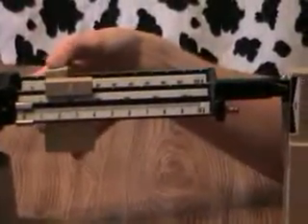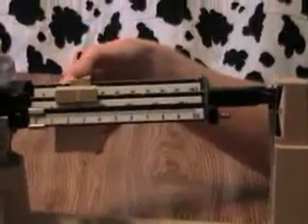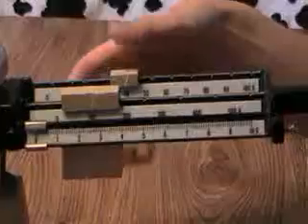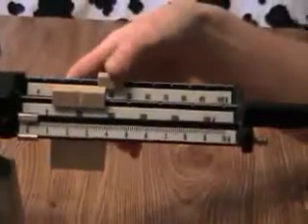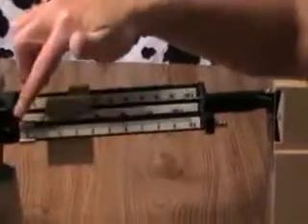I'm at twenty and it's too light. Thirty — too light. Fifty — too heavy. Move back to forty — too heavy. Thirty — good. So now I'm going to move the ones.